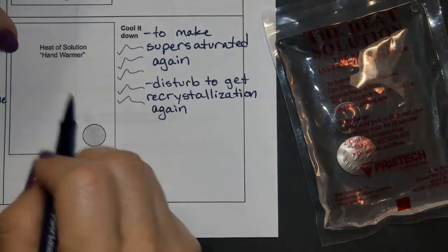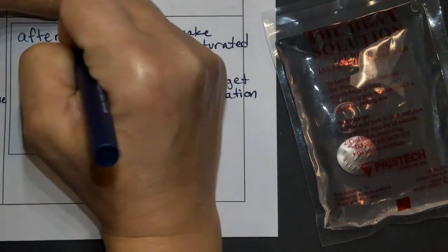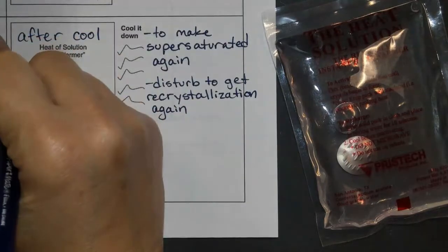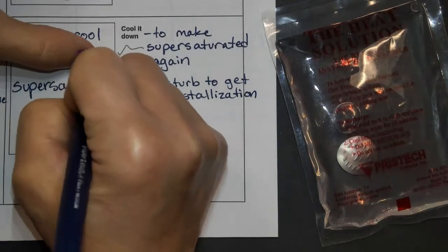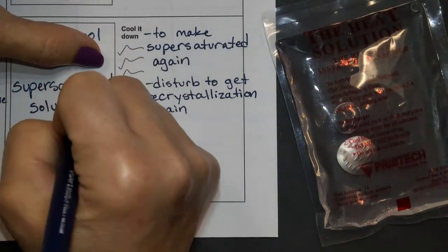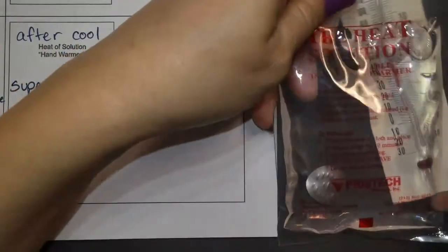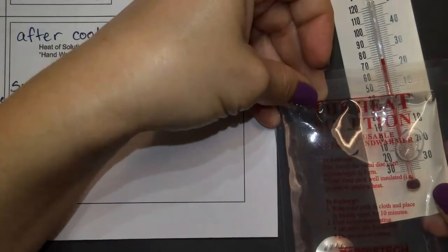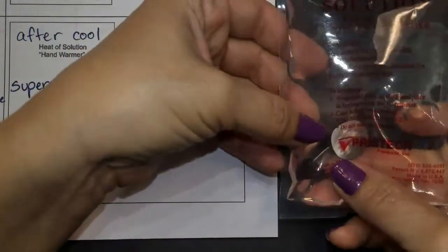Okay, so once you cool it, after it cools, it is a supersaturated solution once again. And of course, we can prove it. Again, here's my cooled one, the one that's cooled off. It's at 76 degrees.